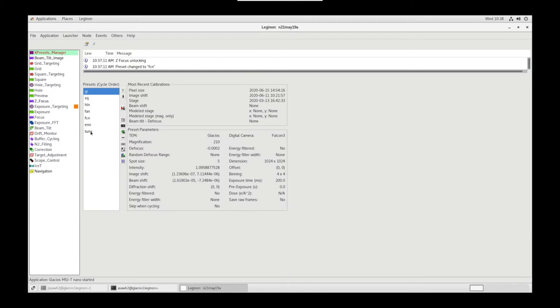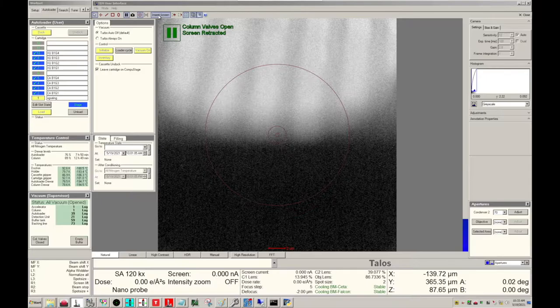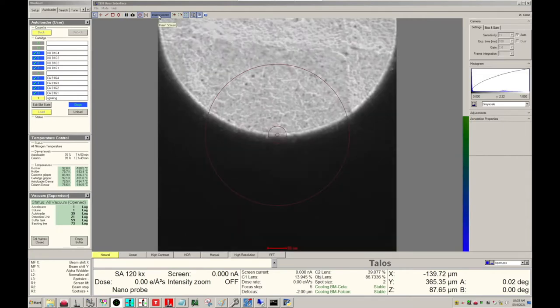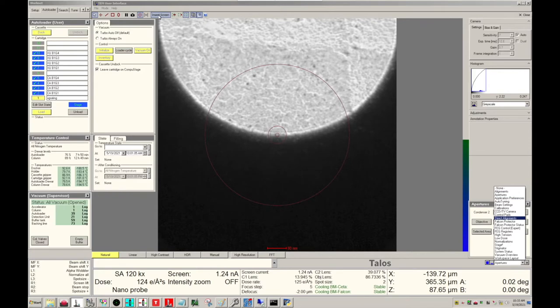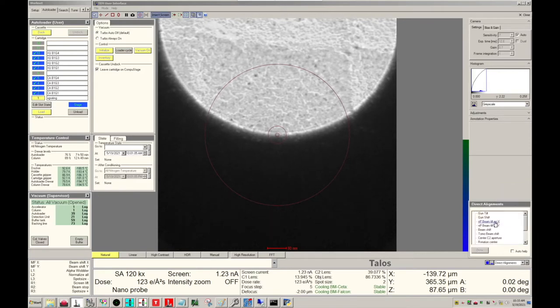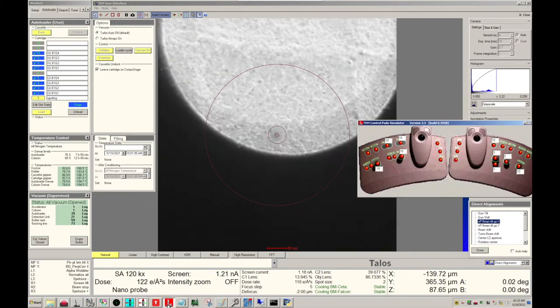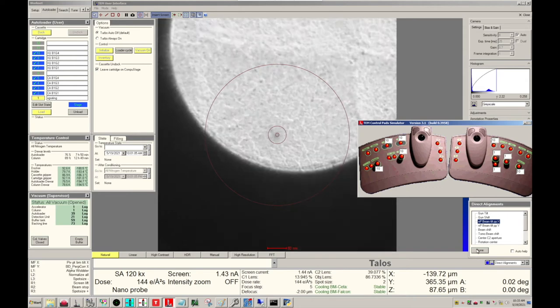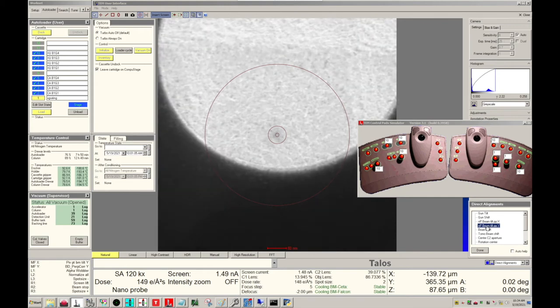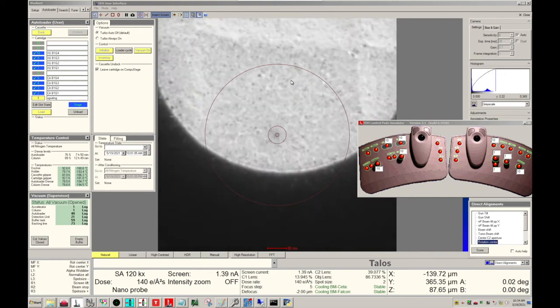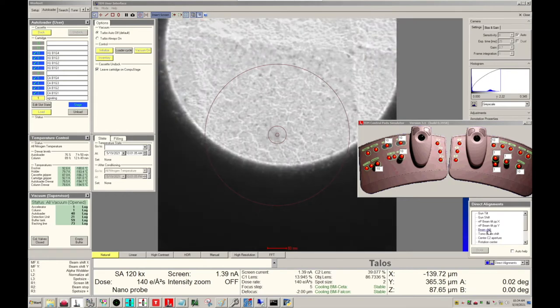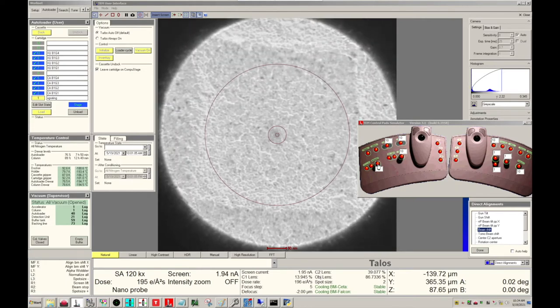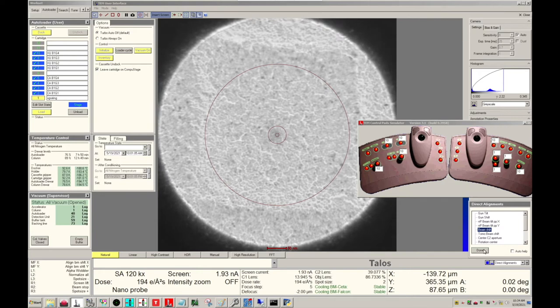Now let's go to Presets Manager and send Tune to Scope. Put the screen down. Let's go into Direct Alignments and select Beam Tilt Pivot Point X. Using the Multifunction X knob, we're going to try to minimize the movement that we see. We're going to repeat this for Pivot Point Y using Multifunction X again, and for Rotation Center, Multifunction X again. Click Done. Then we're going to do Beam Shift. We're going to try to center the beam using Multifunction X and Y knobs. When satisfied, let's click Done.